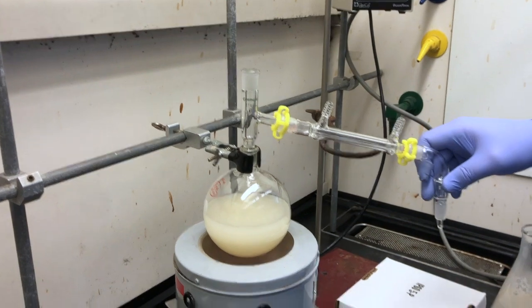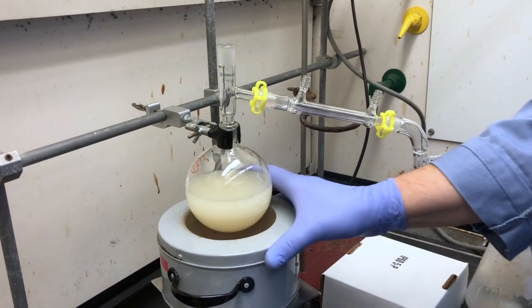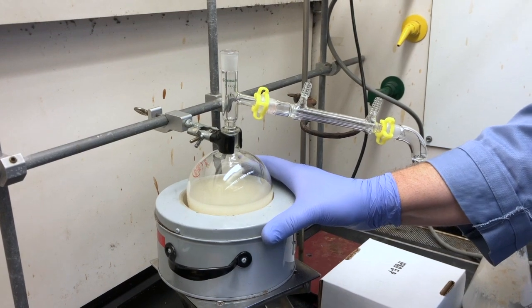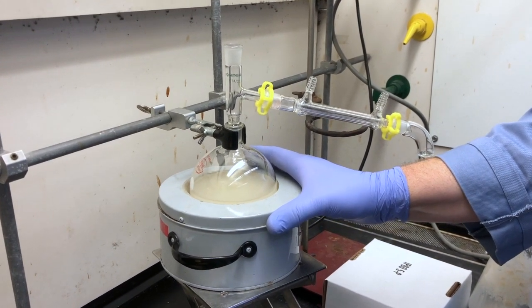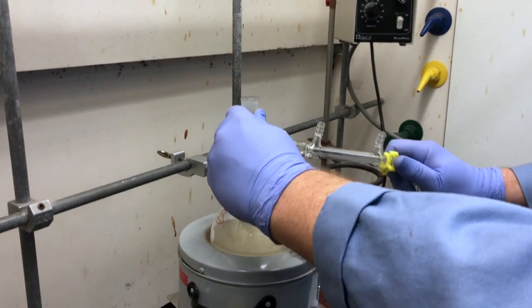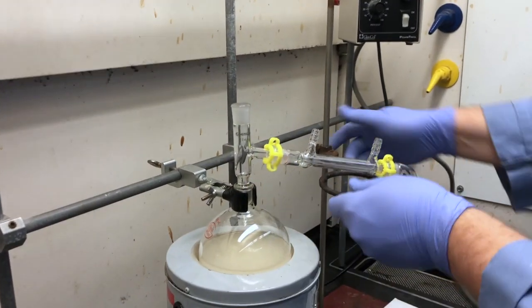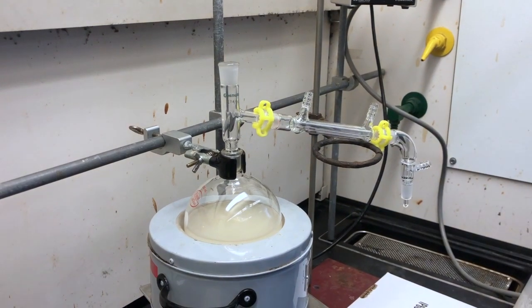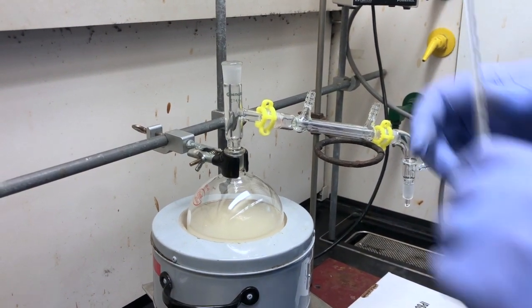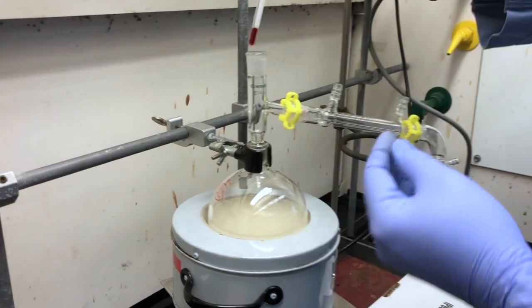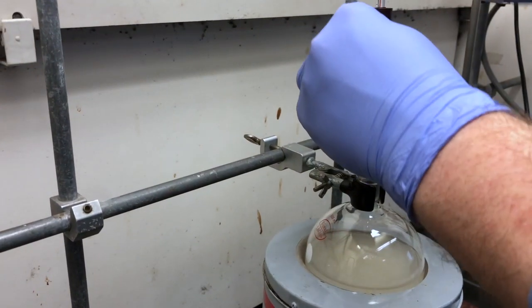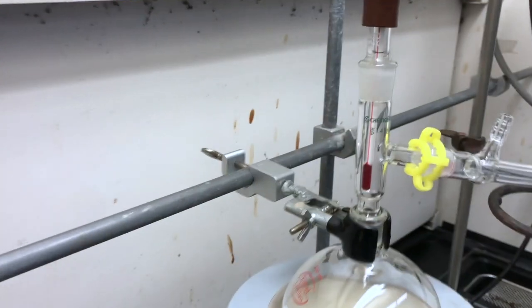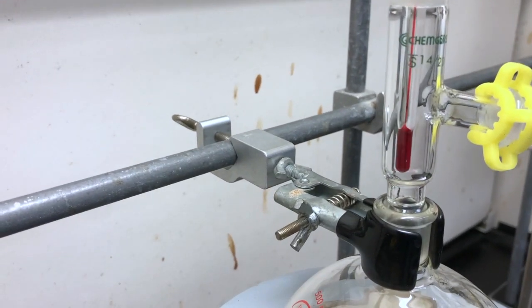We've added some boiling stones to the flask. We can attach the rest of the apparatus and then raise the heater up to the 500 milliliter round bottom flask. We want to make sure that the flask is pointing straight up. The distillation head is perfectly vertical so that the condensation will take place in a downward trajectory. The distillation head is designed so that the condenser will attach at an angle slightly downward.